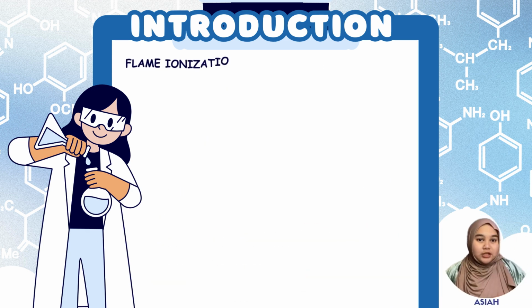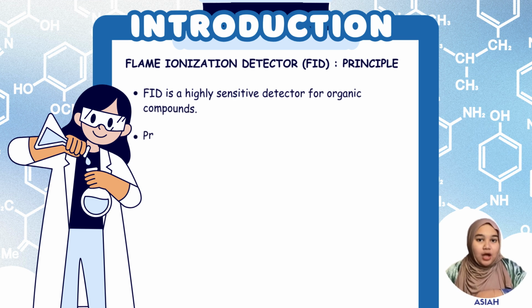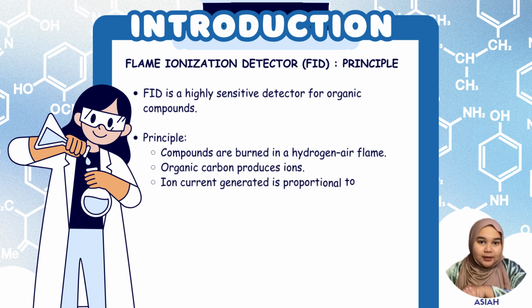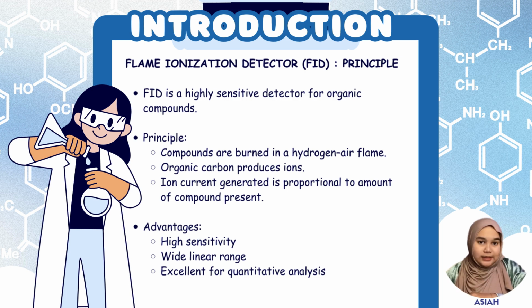Flame ionization detector or FID is mainly used for quantitative analysis. In this detector, organic compounds are burned in a hydrogen-air flame, producing ions. The ion current generated is proportional to the amount of carbon present in the compound. FID is highly sensitive, has a wide linear range, and is especially suitable for measuring organic compounds.